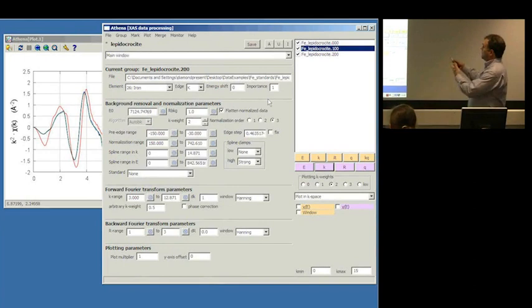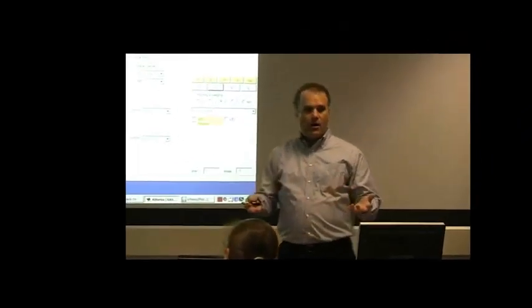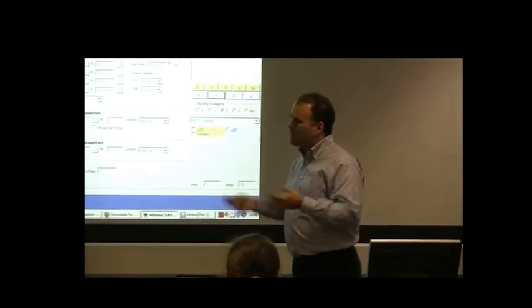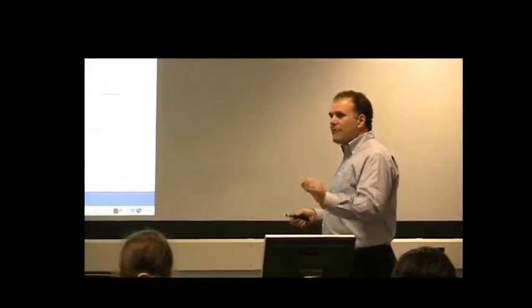So the key, if you want to visualize your data the way I am here, that is 3 scans on the same thing, and I want to look at them in energy, in k, and in R, is that you have to have the same E0 value. That's half of the story. You have to make sure that they're actually all aligned also.